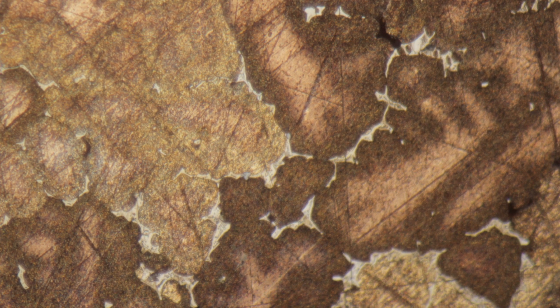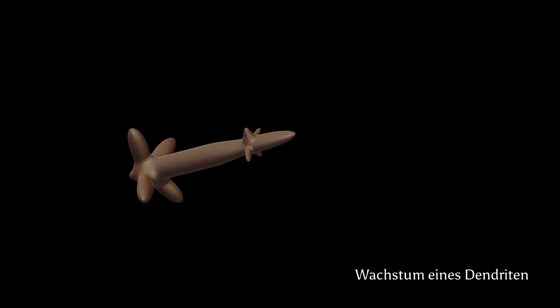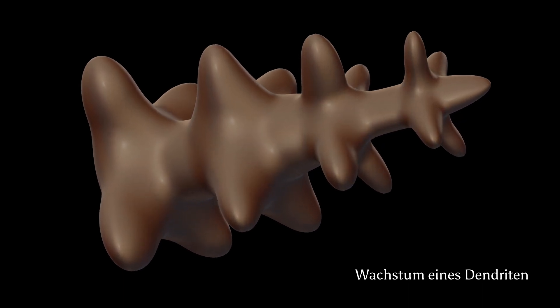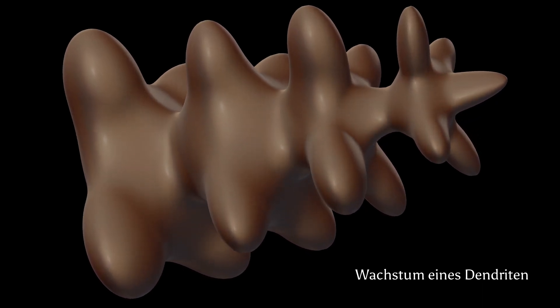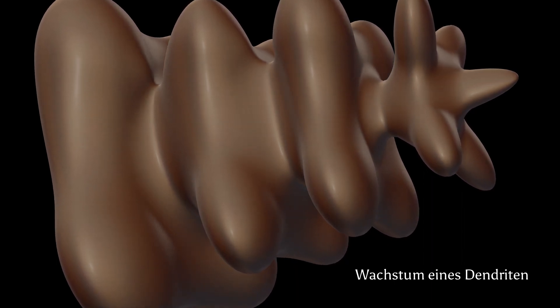If high-copper crystals are crystallizing first, the remaining melt is relatively enriched in tin, leading to the zonal character of these dendrites. The lightly colored phases are a high-tin phase called delta-phase by metallurgists. It is hard and brittle, and is pushed towards the grain boundaries because it solidifies last. The term dendrite is derived from Greek 'dendron' for tree, because their structure looks similar to trees. Dendritic textures are typical for cast objects or objects that solidify from a melt.